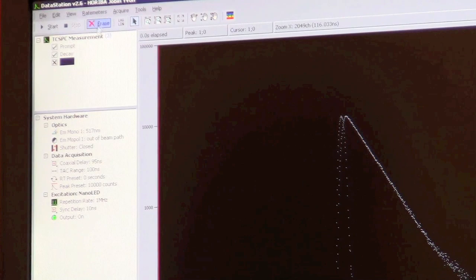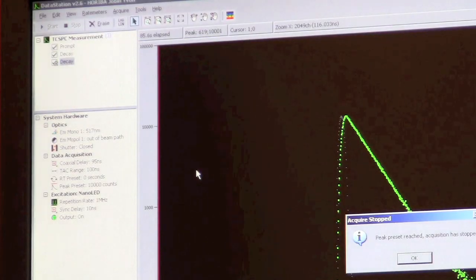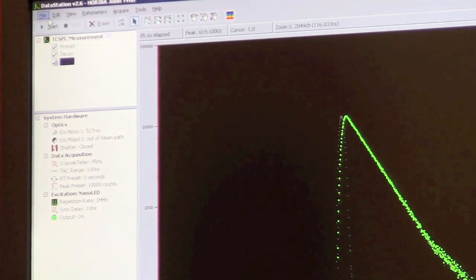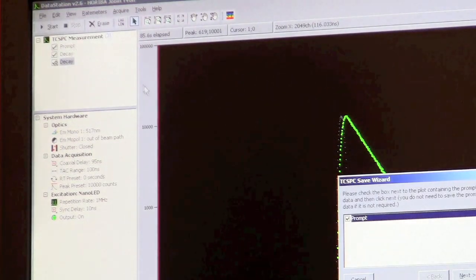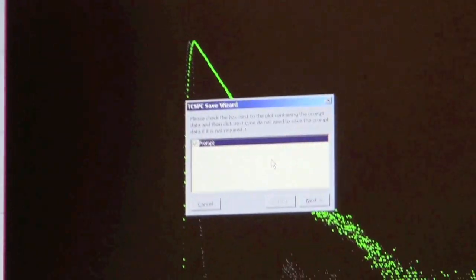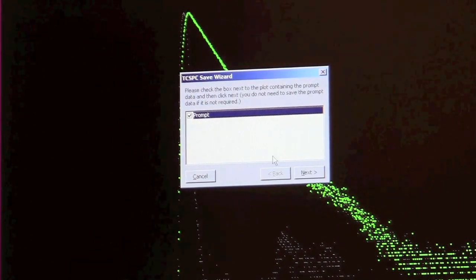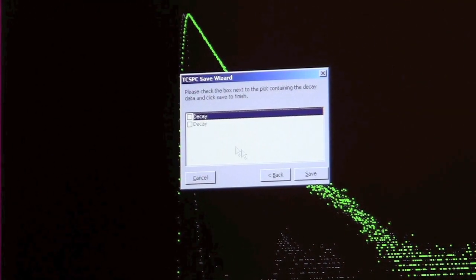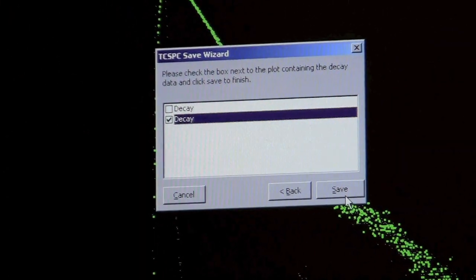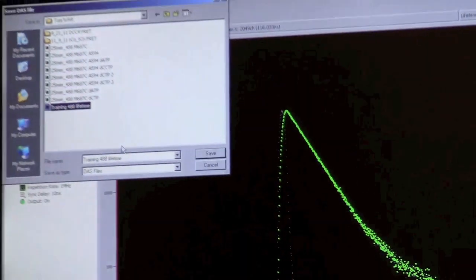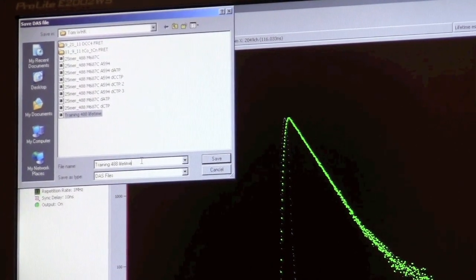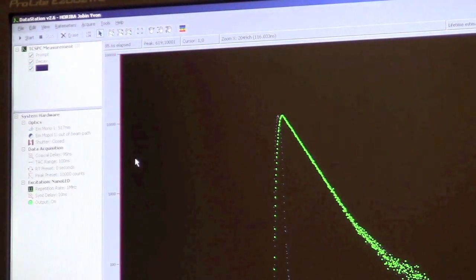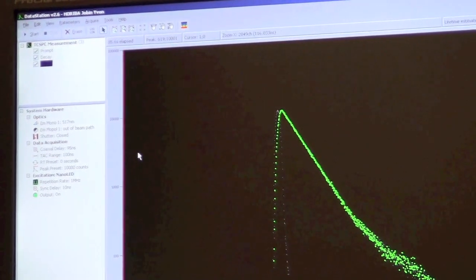We can actually do another measurement just to demonstrate. We're done. To save this one, we go to file and save. Now that we have two decays for one prompt, it's going to ask which prompt you want to save to which decay. We only have one prompt, so we only can choose that one. We want to choose the second decay to save it. That concludes the measurement of 488 lifetime.